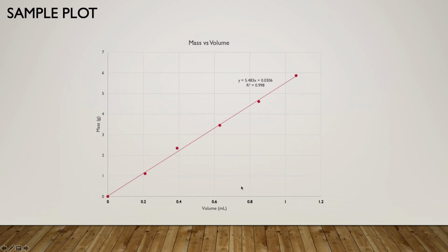So that's kind of what you're working towards at the end of the lab from a calculation sense, and making these plots is really because we just want that linear regression line. It's really going to help us figure out almost an average density between everything that's standardized a little bit better, rather than just having actual densities of each individual data point and looking at how close each one is, because singular measurements do have a decent potential for error.